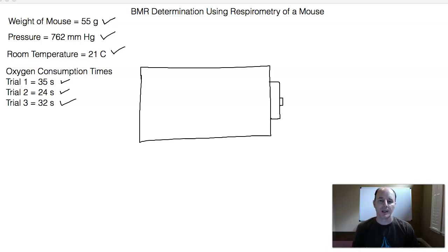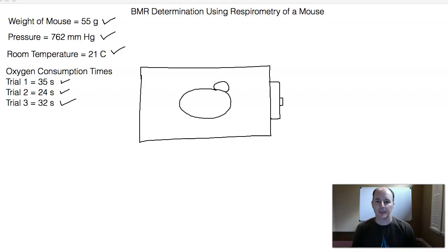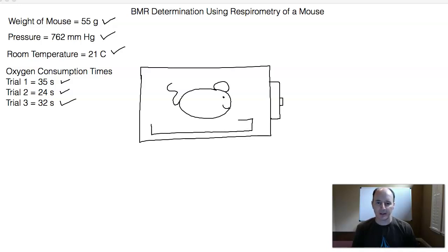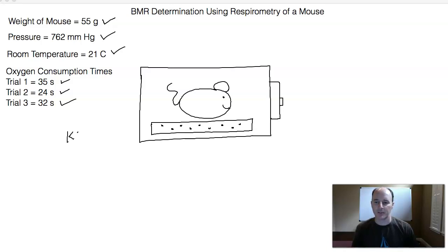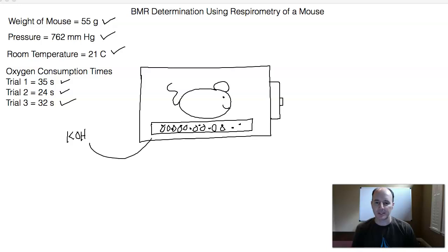This is what the chamber looks like, and inside of the chamber you're going to have your mouse. Along with the mouse, we are going to have a straw placed in there, and that straw is going to have holes in it. Inside of the straw is going to be something called potassium hydroxide — KOH pellets. Those KOH pellets are going to be found inside this straw that has the holes poked in it.